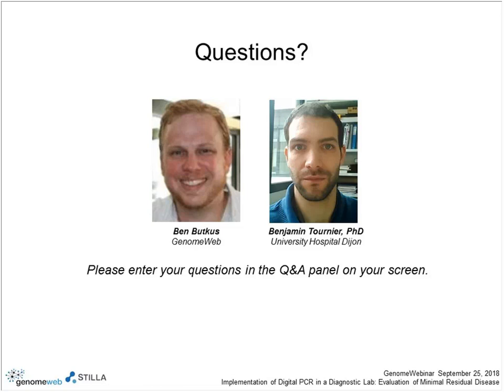And if you want, you can test other mixes for PCR and validate them, it's possible. But for Stilla, only the PerfeCTa mix is optimized. But it's always possible to test other mixes if it works in your conditions.